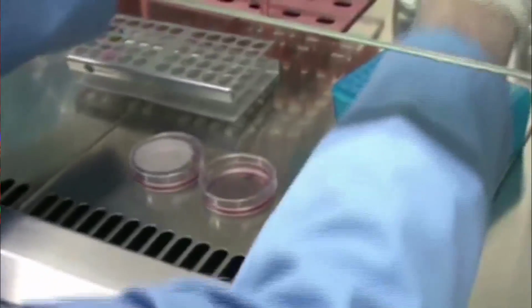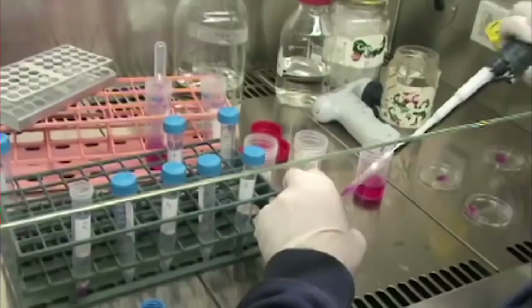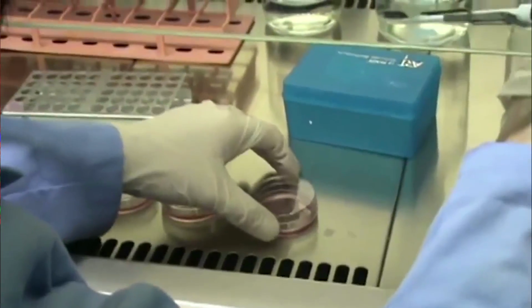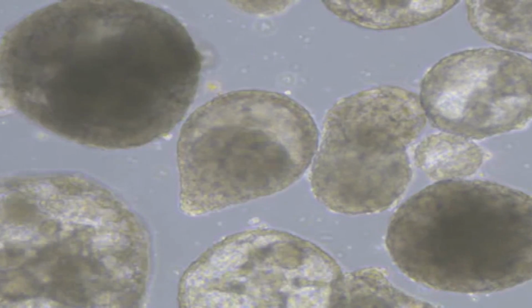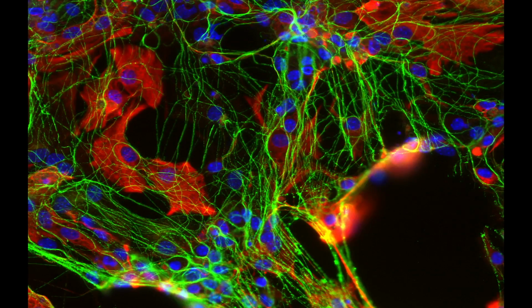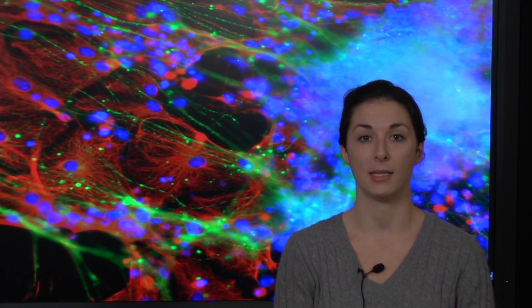So this image shows pluripotent stem cells which have been induced to differentiate into neural tissue. So we start with mouse stem cells, which are pluripotent, which means they can differentiate to become any type of mouse cell they want to. And we allow them to aggregate and create clusters of cells called embryoid bodies. And these embryoid bodies grow similarly to how an embryo would grow as a mouse develops in utero. We induce them and push them to become neurons by treating them with various cytokines and chemokines that will help them go down the neural lineage and become neurons.